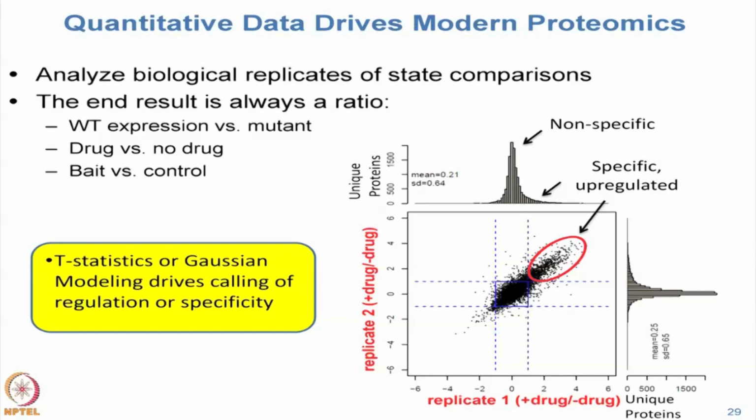Most of what you detect is probably going to be unchanged between the conditions, and you're looking to do statistics to recognize some subset of things which change between the conditions. Okay? All right.